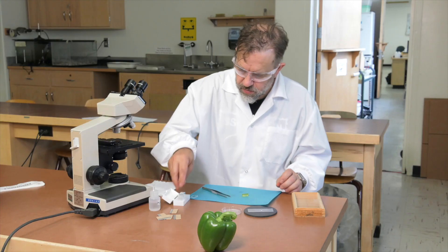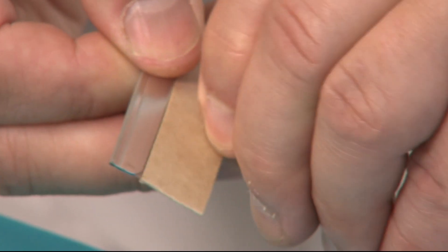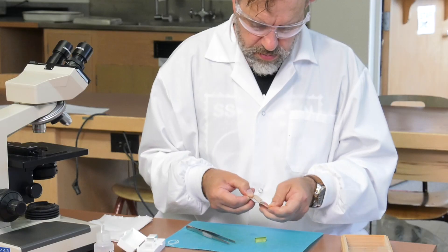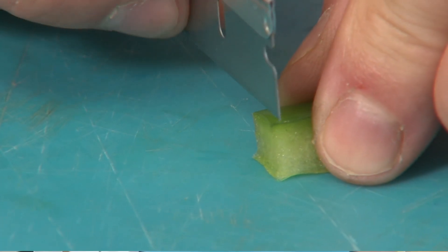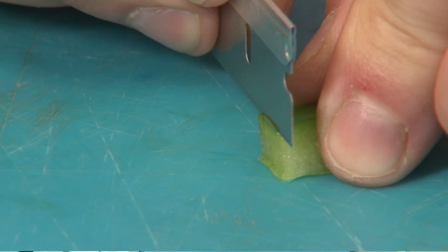Place a piece of green pepper on a flat surface. Use a razor blade to cut several thin cross sections by sawing at the piece of pepper with a smooth back and forth motion, as if you were cutting a slice of bread from a loaf.